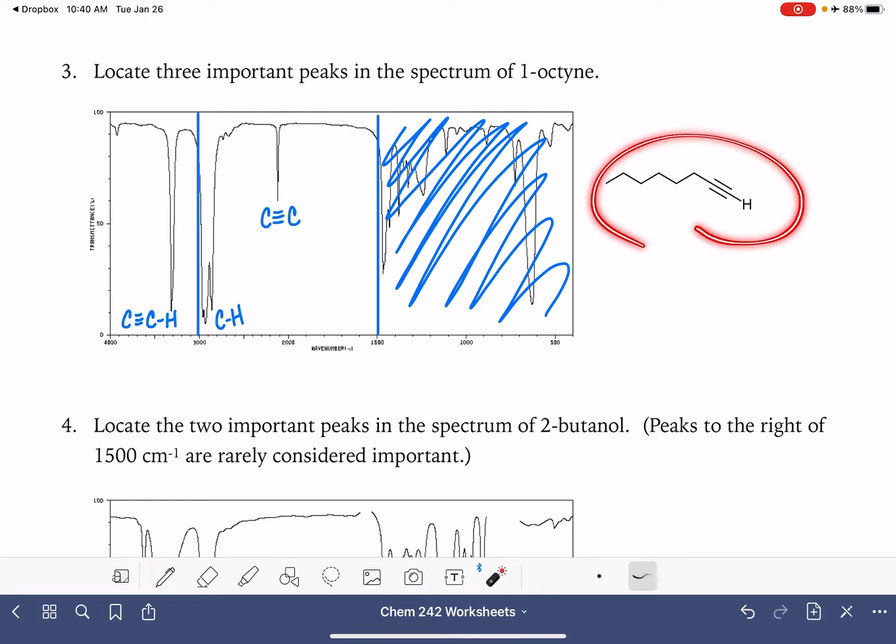If I didn't know that the molecule was an alkyne, how would I know that this is a triple bond versus a double bond? The triple bonds do tend to show up more in the center of this particular area, whereas the double bonds tend to kind of hug that 1500 line.